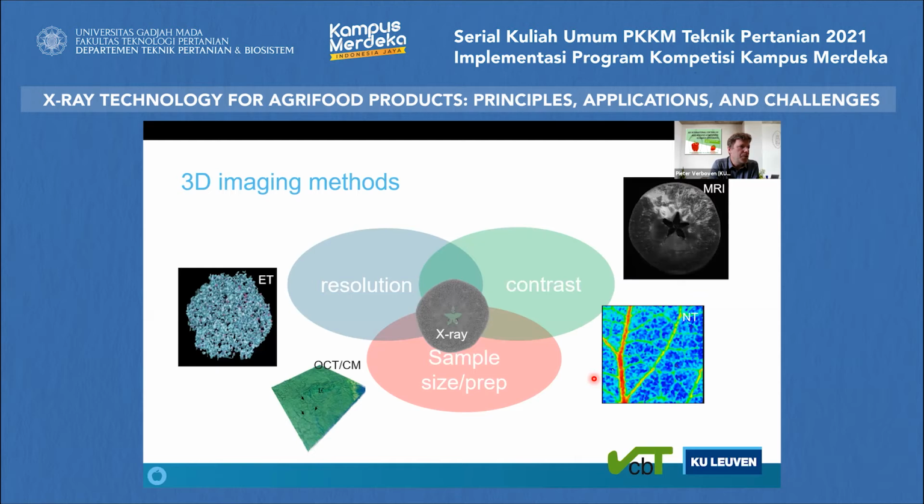So what are these tomography or 3D imaging methods that are available to us? I give a few here. It's not meant to be completely complete, let's say, but at least it gives you some idea of what type of techniques are available there.